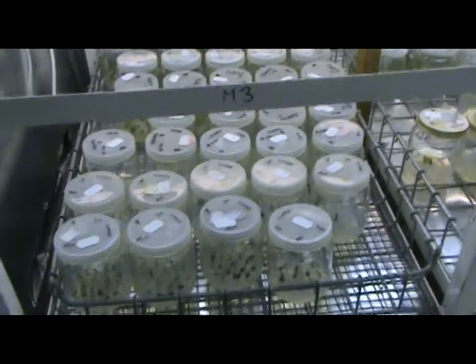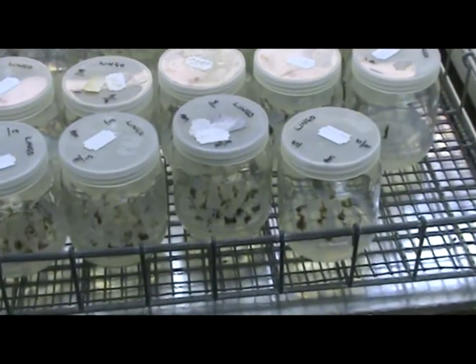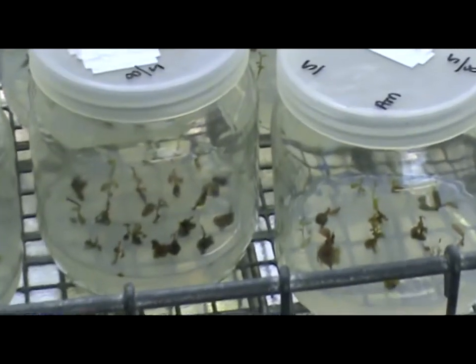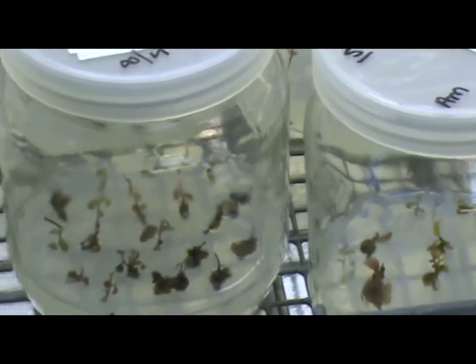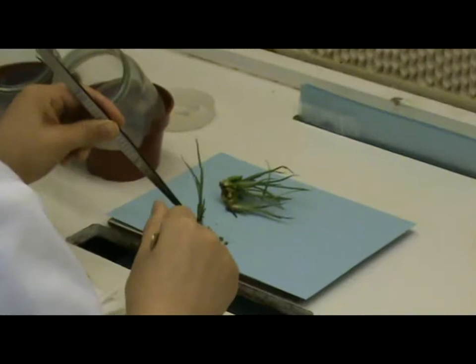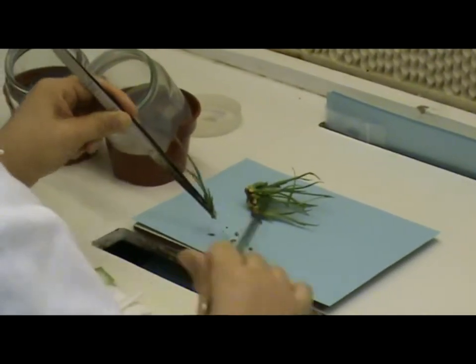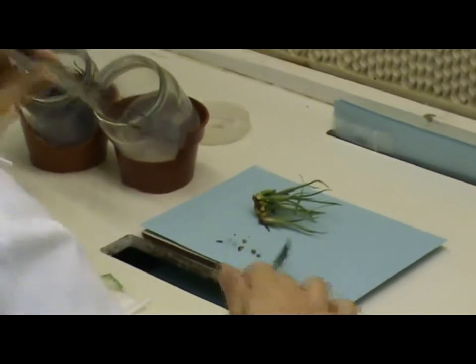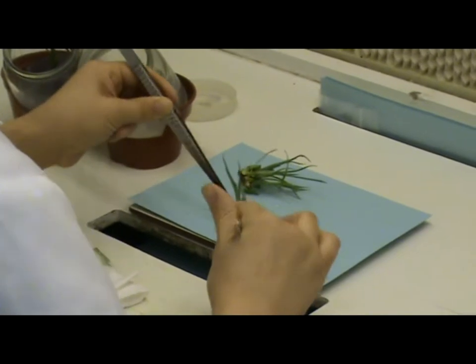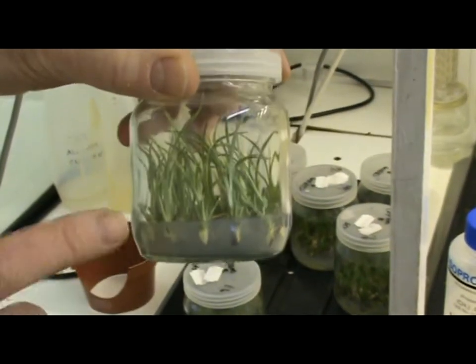And then we put that onto sterile culture medium, and hopefully after a short time we'll get some growth of a few leaves and a shoot, and provided it's sterile, it then gets transferred onto fresh medium and begins to multiply. And at that point it's just a handling exercise to divide it up into more and more pieces until we get enough so that we can then start cropping those as little mini cuttings, really, putting them onto a rooting medium, and then after a week or two plant them out into compost.